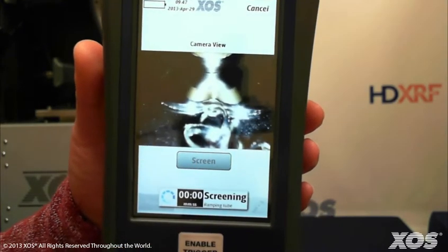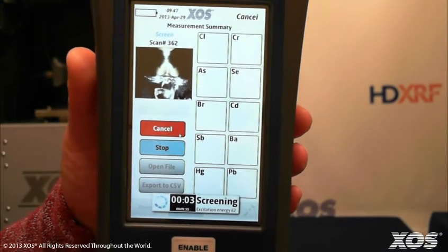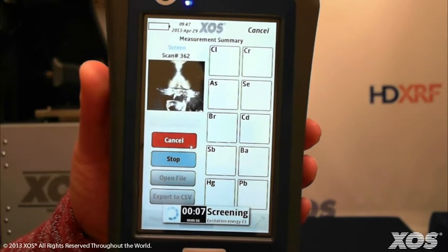The instrument will collect data for 10 seconds before reporting an initial result. Every 10 seconds thereafter, the results update based on the data collected. When you have confirmed the presence of an element you are concerned with, press stop to finish screening.